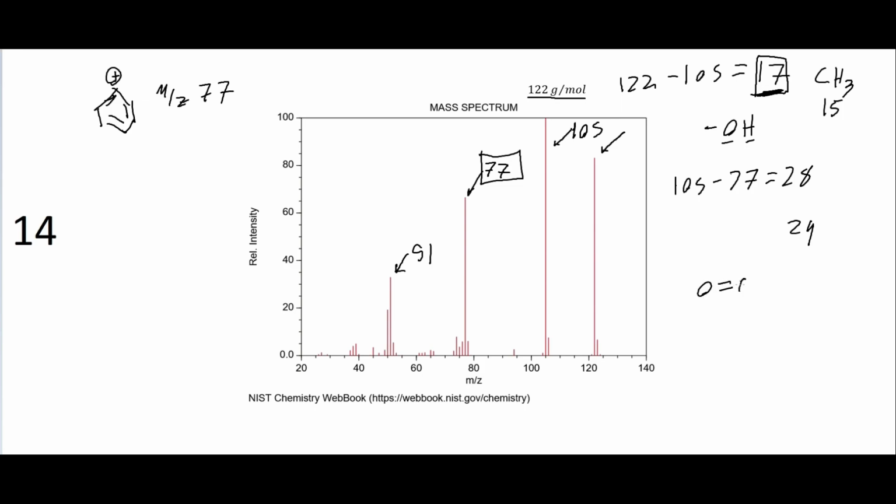And that would be a pretty good candidate because that would give us something that looks like this. So we have our C right there, the O right there, and maybe a positive charge right there, which is resonance stabilized by this oxygen.